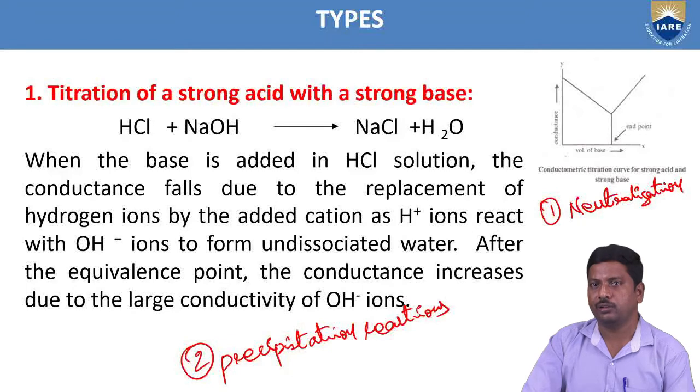Even at very low concentration. Mainly based upon these two reasons, we have moved from classical methods of analysis to instrumentation methods of analysis. And what are the neutralization reactions involved in conductometry?